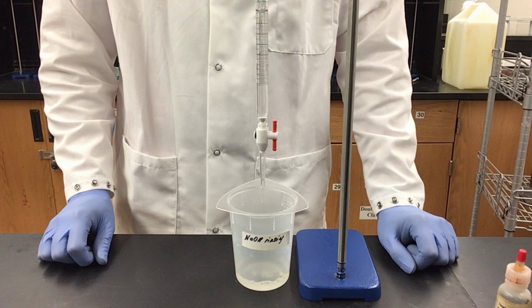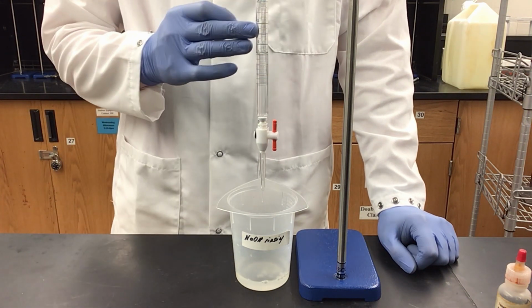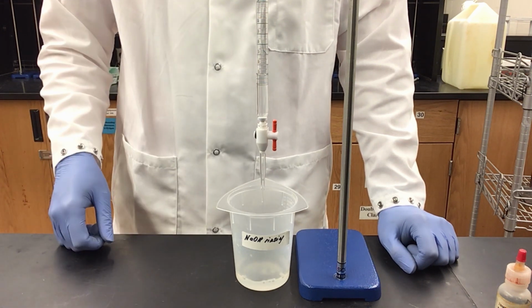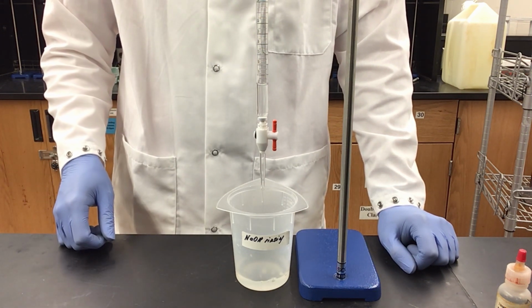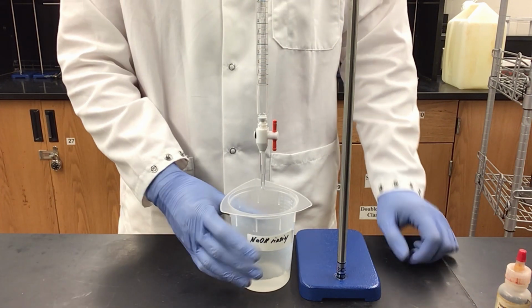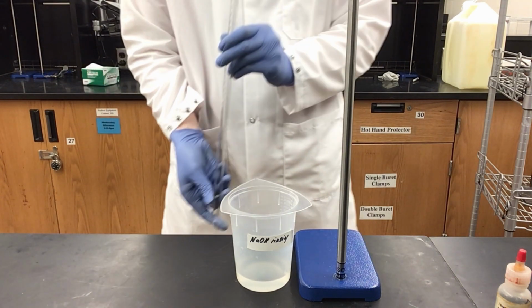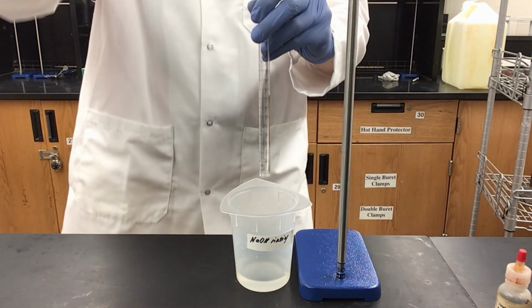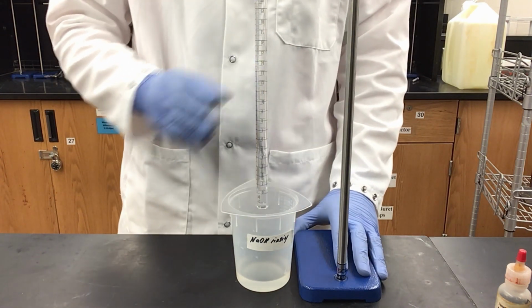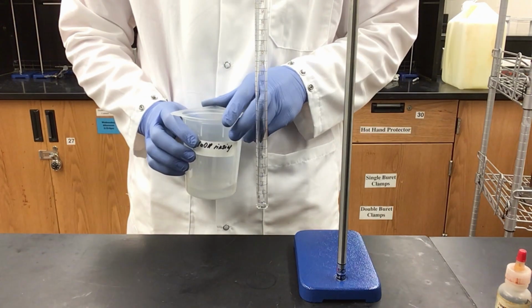If you are the final lab at the end of the week, you will actually rinse the burette with water and then fill it and cap it so that it can be put away into storage just like you found it when you got it out originally. So now that my burette is empty, I will invert and reclamp, and now I can leave the burette like this for the next lab. Now I will go and dispose of my sodium hydroxide.